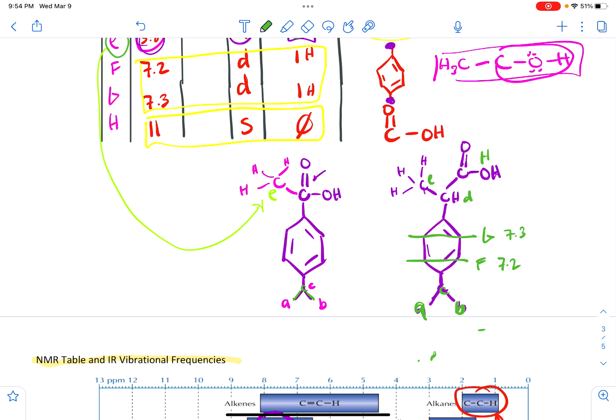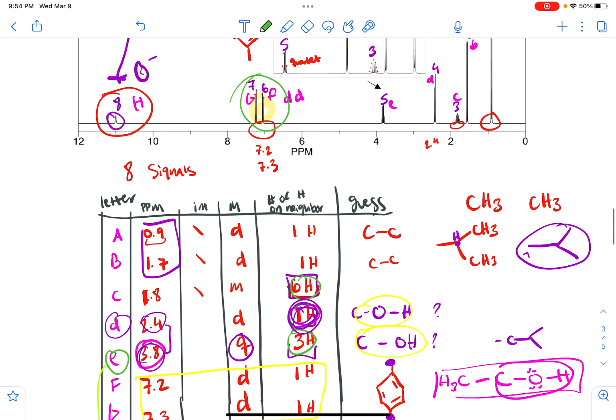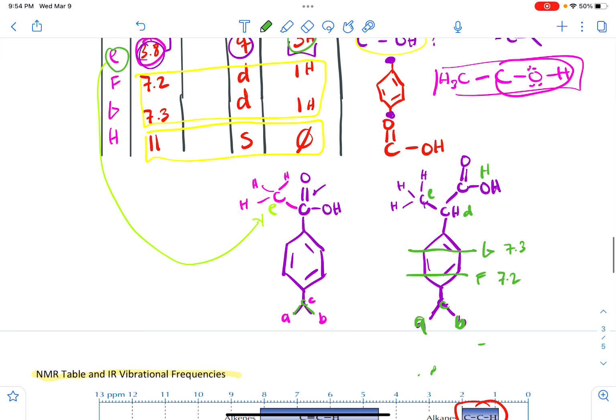And so to conclude, I just want to re-emphasize that this spin-spin coupling pattern is the parabenzene because of the equivalent hydrogen regions. If the substituent groups were different, it would have 4 signals instead of the 2 that you see there. So that would be one reason why that would not work out there.